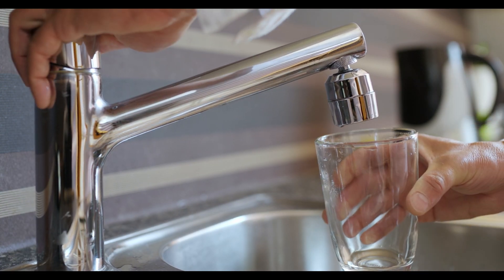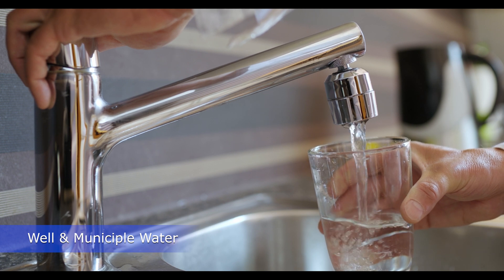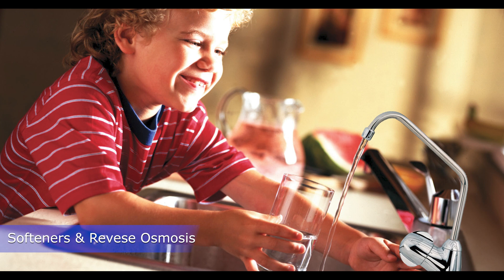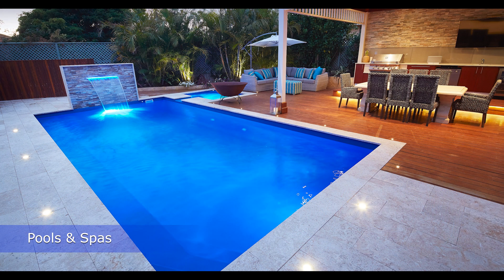The hardness test strips can be used to determine the hardness of well and municipal water, to ensure your water softener or reverse osmosis filter is working properly, and to monitor hardness in your pool or spa.